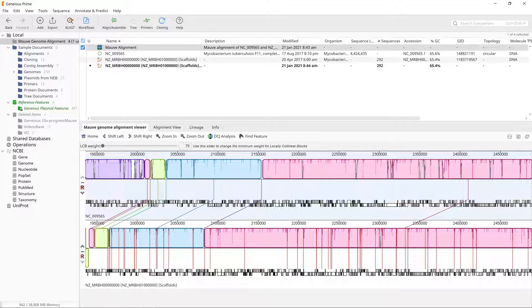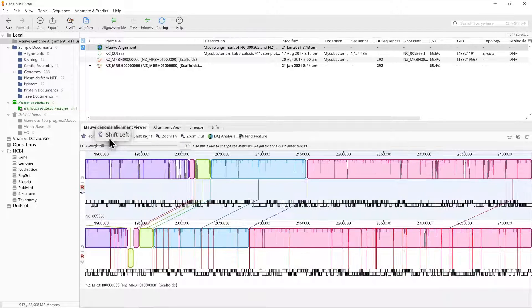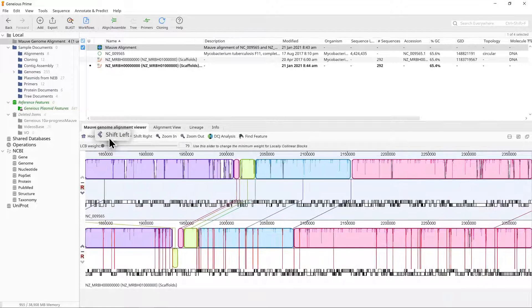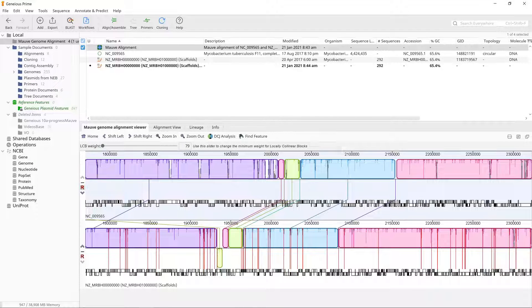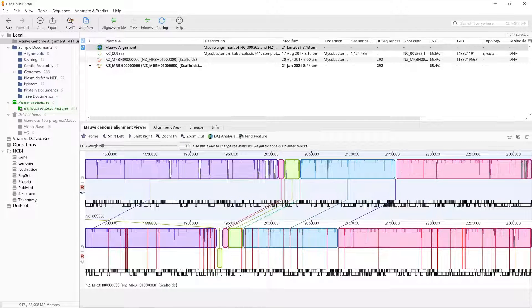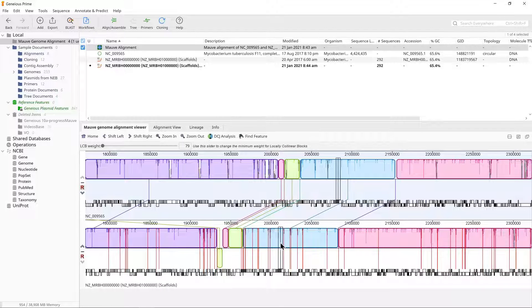Click the zoom in button a few times and then use the shift left button to move to approximately position 200,000 in the NC_009565. You should see a large light blue block that has several red vertical lines on the lower block denoting contig boundaries.